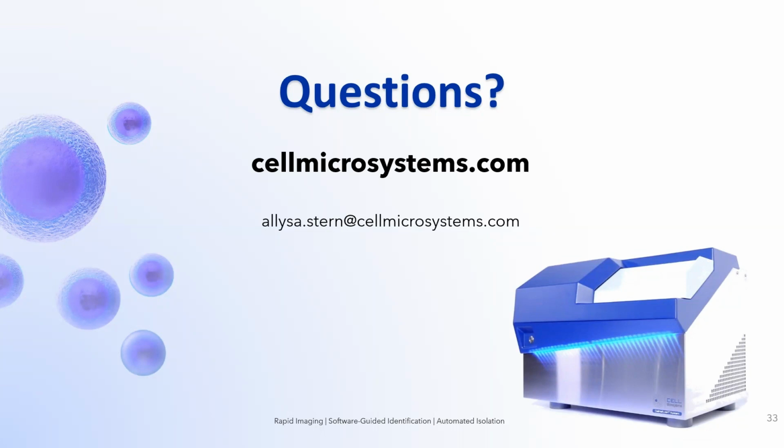You can do kind of artificial growth rates if you've captured the images of those organoids over time. So if you're interested in looking at a certain size cluster of cells or single cells at an early time point, and then you want to sort that population based on a size somewhere midway in your protocol, to make sure that what you're isolating is actually across a protocol of development more similar, that's also possible.